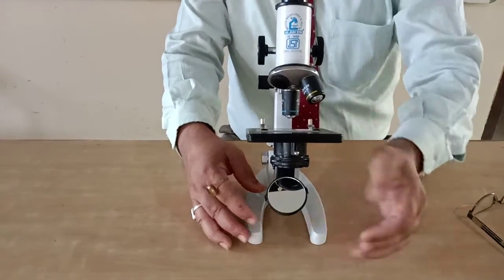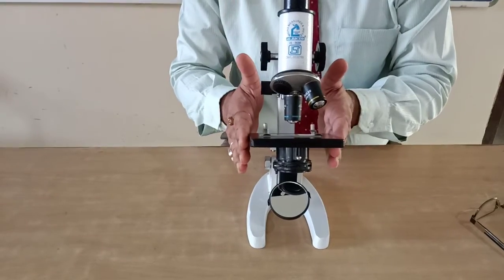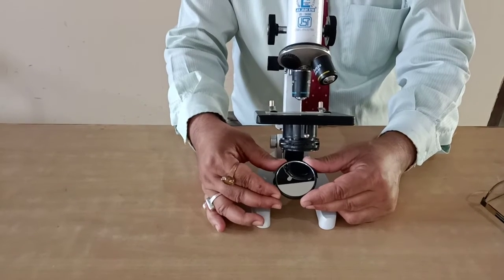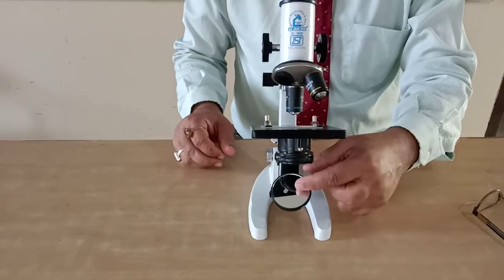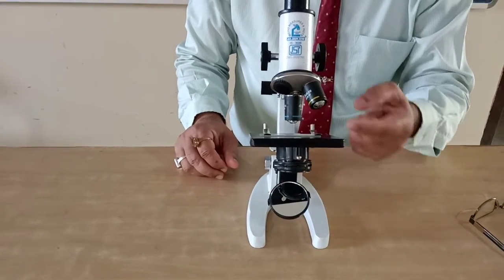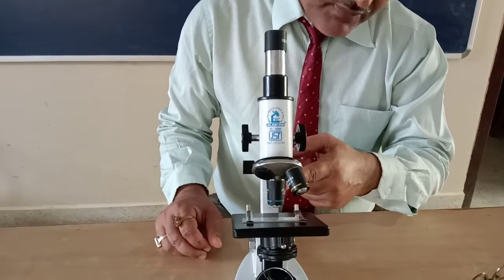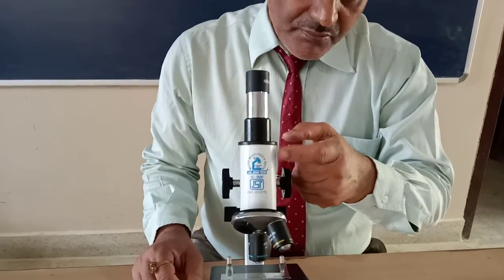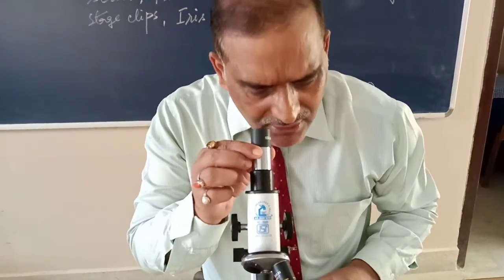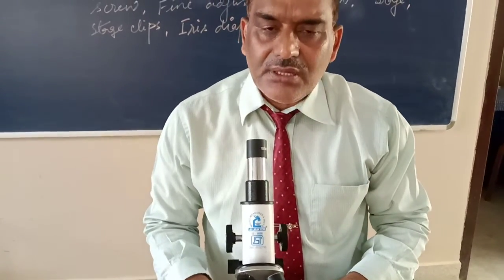It should be directed towards the window so that sufficient light may fall upon this mirror for reflection. Light is reflected this way, passes through the diaphragm, then through the slide, then through the objective lens and the body tube, and then it comes to the eyepiece, and here we can visualize the object. So this is the working of the compound microscope.